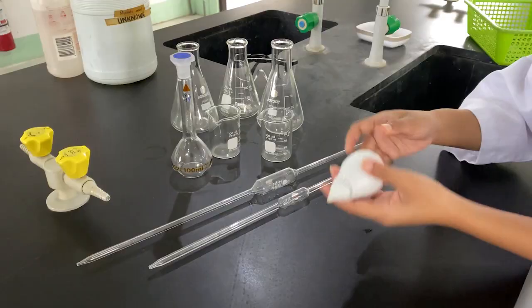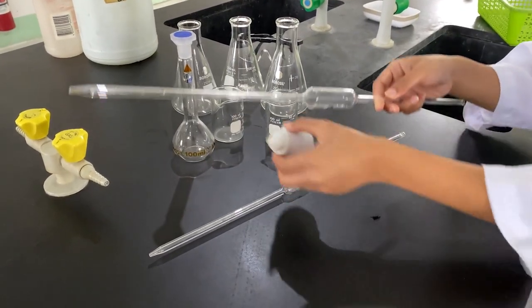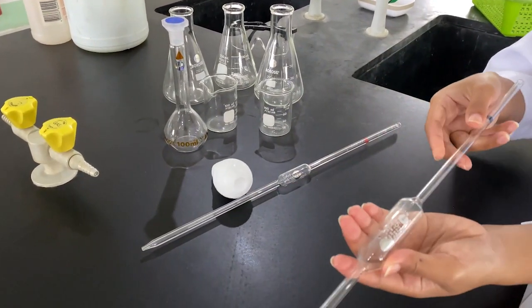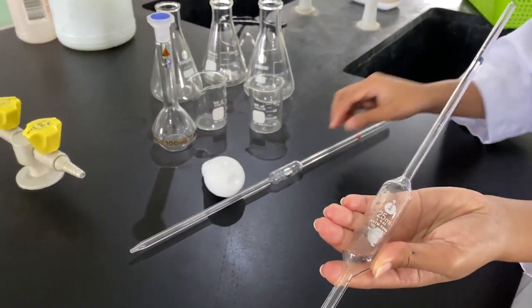The beaker, Erlenmeyer flask, volumetric flask, volumetric pipettes, both the 25ml and the 10ml.